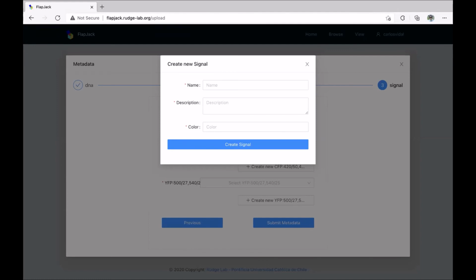But we could think about that in future. It would definitely be a useful feature. For example, if you have assays which have common metadata, you could say all my 10 assays have the same layout, etc., and here are all the files for the data. It's definitely easier at the moment to do it via the API and the Python package.